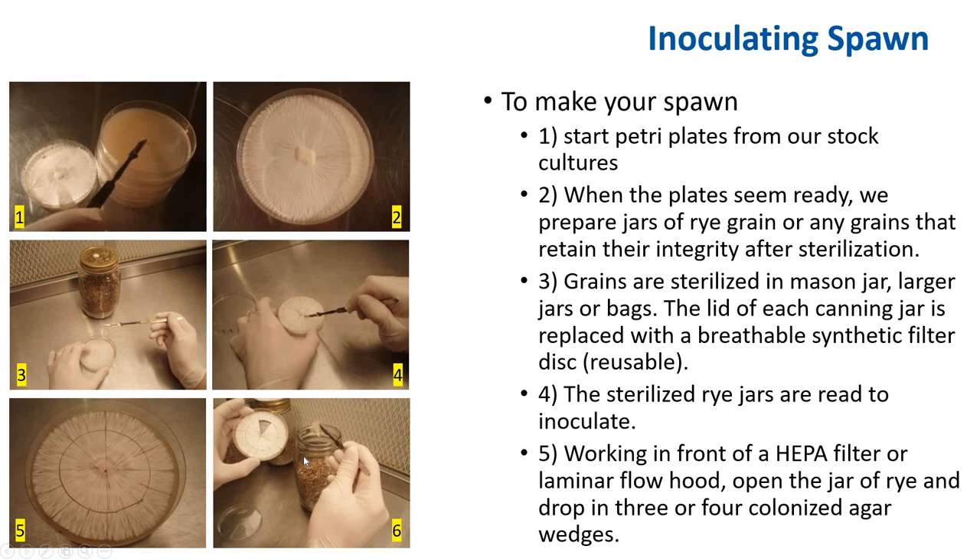Transfer the agar pieces into your colonized rye berries. After a few days at room temperature, the mushroom mycelium should have grown from each wedge surrounding the rye berries. Then take the jar and distribute the colonized rye berries by shaking it. Do not hit the jar with your hand — once the glass goes under pressure a couple of times, it is very susceptible to breaking and these glass edges are very sharp. Never hit the jar with your hand; just gently shake it. After shaking, the rye berries will be mixed up and loose. Your spawn is ready for use.